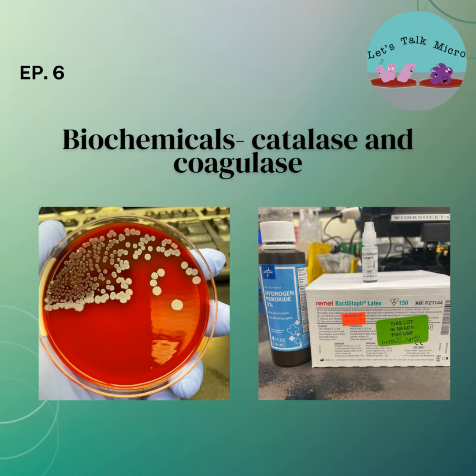Please be mindful that some organisms, like Staph saprophyticus and Staph schleiferi, can have false reactions. So always correlate with your morphology. Staph aureus is beta hemolytic, though sometimes it can have a weak hemolysis. So if you get a positive reaction but the hemolysis is weak, do an ID by another method, like the Vitek, MALDI, or MicroScan. Don't go with Staph aureus right away.